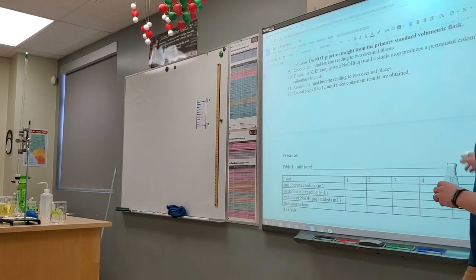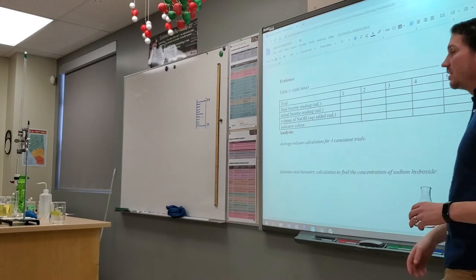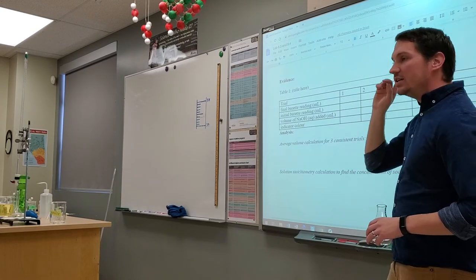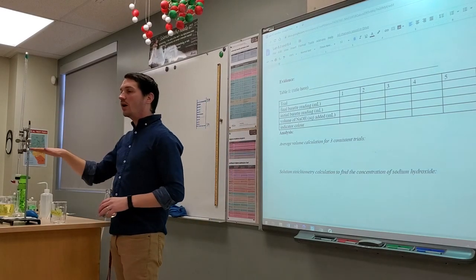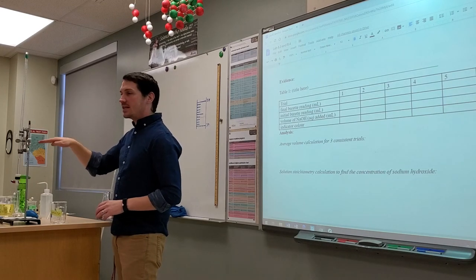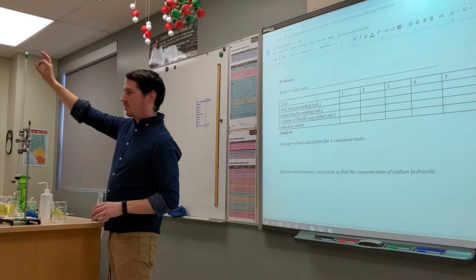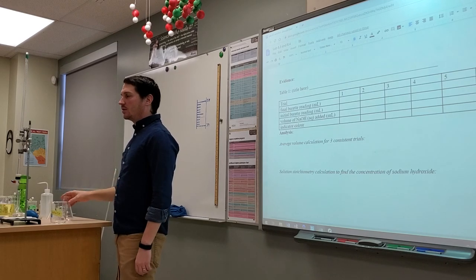Okay? So here's the idea. We're giving you lots of room to be able to write down your results, right? Your initial goes under initial, your final goes under final, but your final burette reading, you'll carry over to the next initial, right? Do not start a new titration if your volume is lower than 35 milliliters. Top it back up, get a new initial volume, and then start going. Does that make sense? Good.